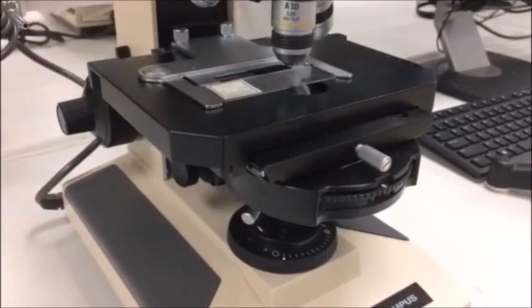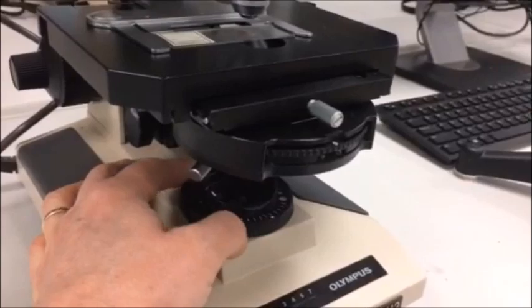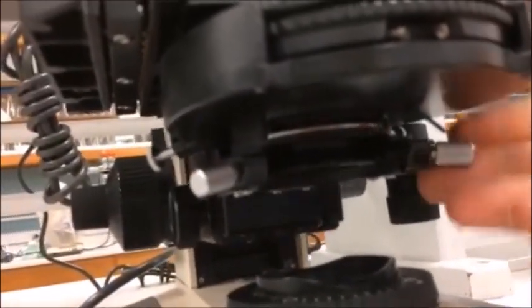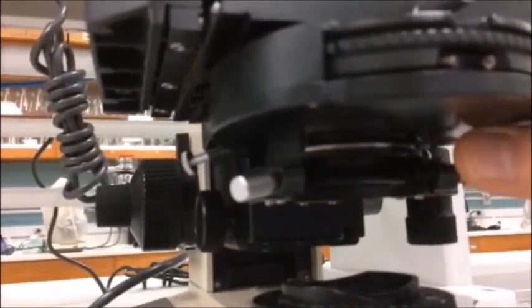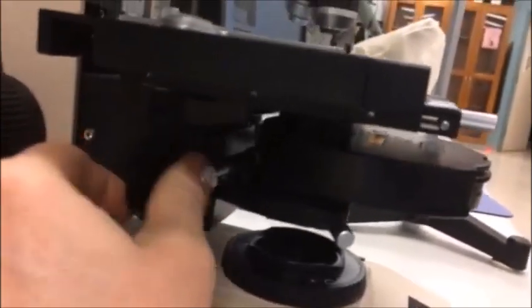So assuming that I'm focused on the slide, the next step is to close the field diaphragm all the way to the counterclockwise and check underneath the stage. There's a little sliding lever here. This one needs to be pushed all the way over to the right. And then the other thing that you want to do is to make sure that the condenser is cranked all the way up to the top.